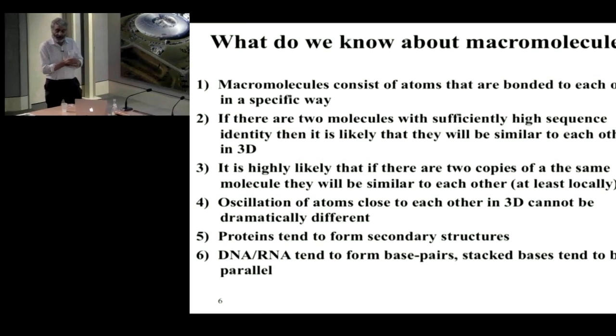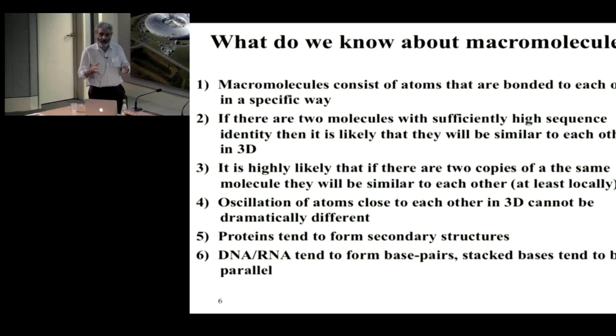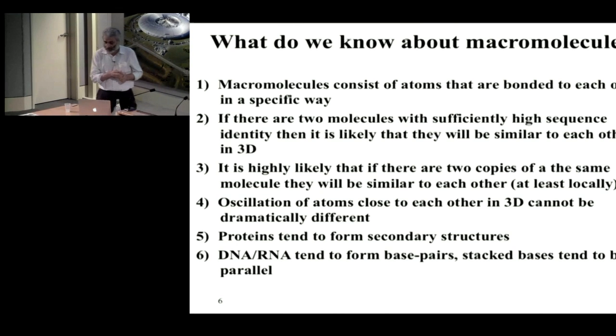Since EM maps do not have very high resolution, they are at medium resolution. I think the highest resolution, in spite of claims that it's at 2.2, is around 2.5, 2.6. So we need to use some information about the structure, about macromolecules.